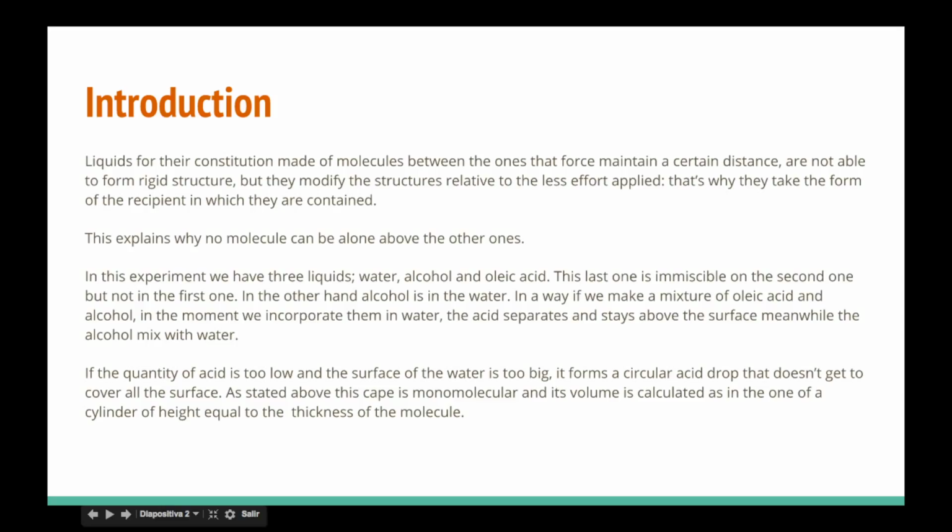In this experiment, we have three liquids: water, alcohol, and oleic acid. This last one is immiscible in the second one, but not in the first one. On the other hand, alcohol is miscible in water. In a way, if we make a mixture of oleic acid and alcohol, in the moment we incorporate them in water, the acid separates and stays above the surface, meanwhile the alcohol mixes with water.